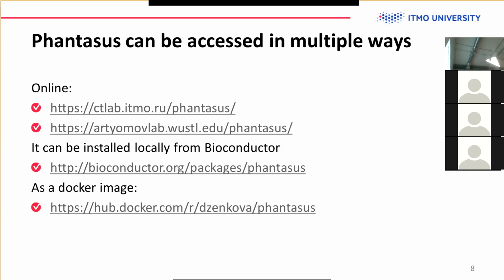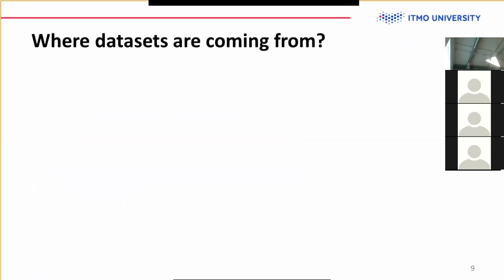Again, it's a web application. We have two official mirrors, at ITMO and Artemov Lab, one in Russia and another in the US. You can also install it locally. At some point I used the local version a lot, which is very convenient. But otherwise you can just go to the website and do some analysis, and that's what we'll be doing today and tomorrow and so on.